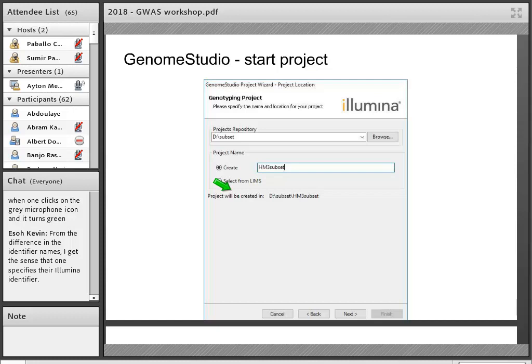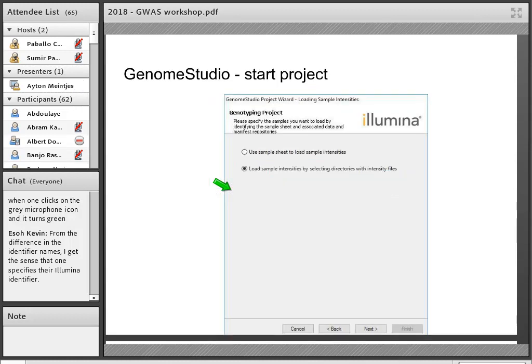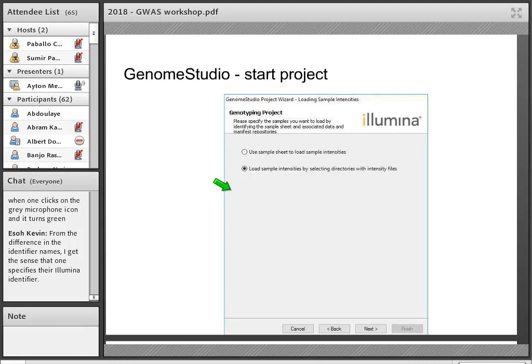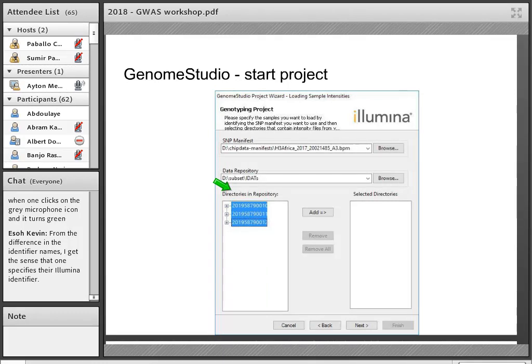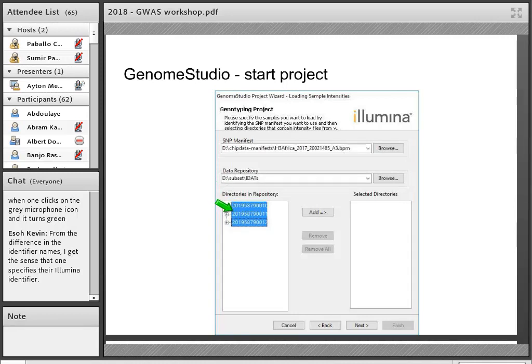But basically once you've got Genome Studio and you've got your data set from whoever the providers were, you should be able to load this in yourself. There are different levels of loading it in that you can get depending on whether you've got the cluster data or not. So quick walkthrough of the steps. You basically say you want to do a new project, you create it. You can see the option sync from LIMS is there, so that sort of suggests that this is software that's often used more in the wet lab environment.